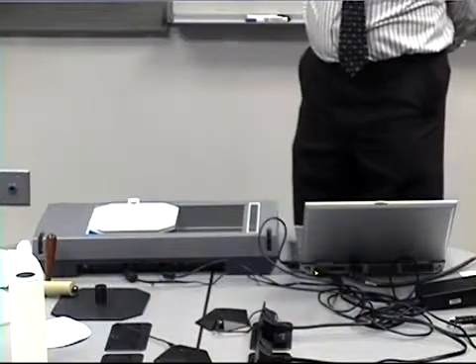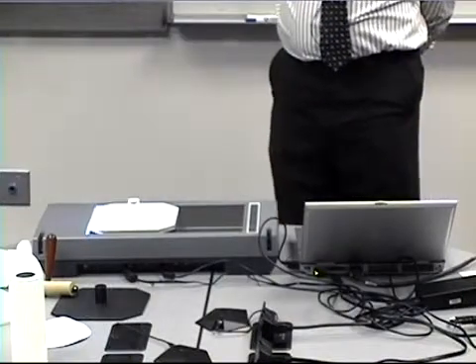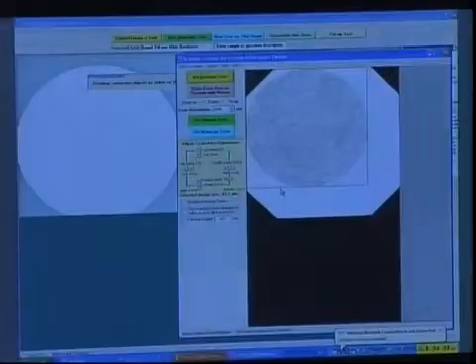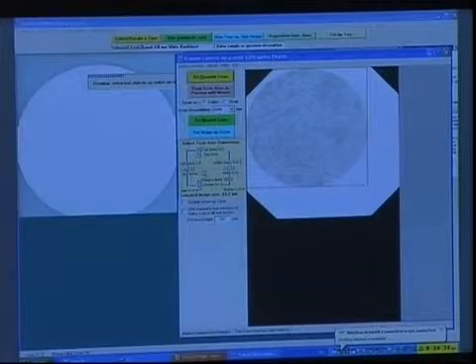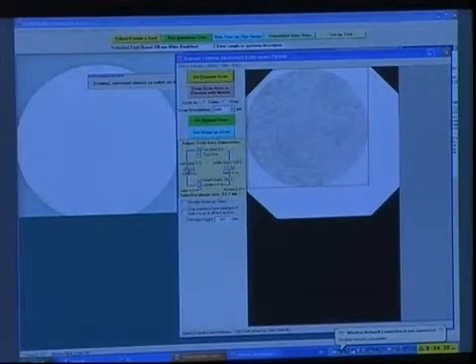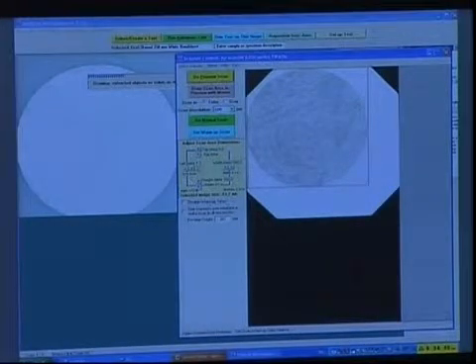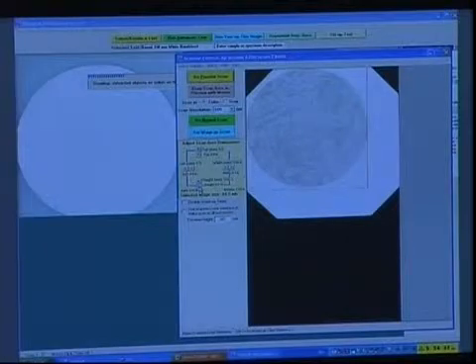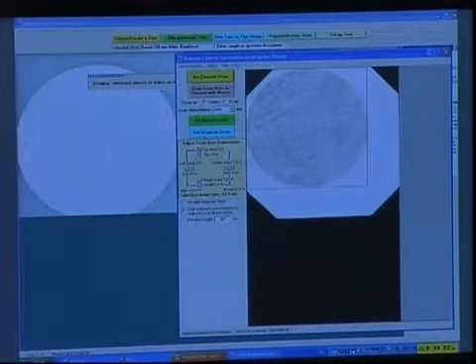But the scanner is designed to just make a rectangular image. Now, that's what you saw. And we have the ability to adjust the scan area using various controls in the software. Looks like we go all the way to the edge, and actually the measurement is just about right. But you can see how we can adjust the scan area. So we'll do a normal scan.